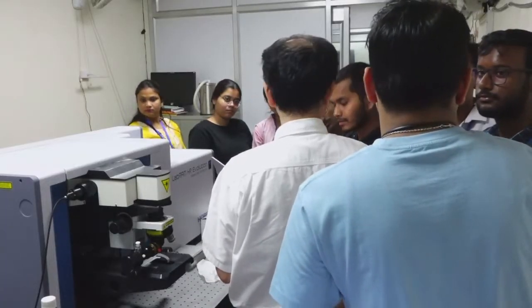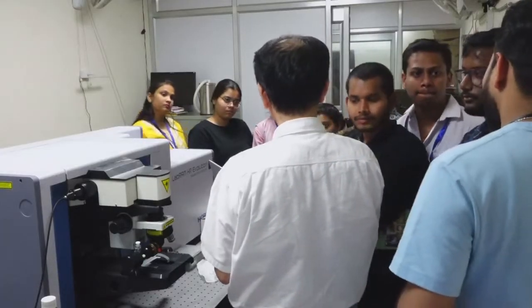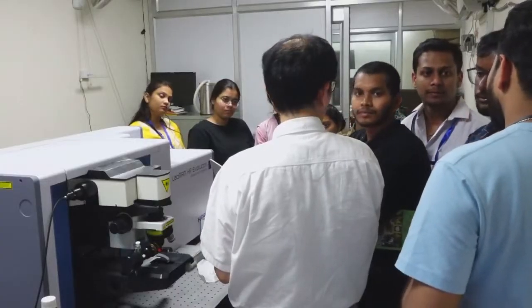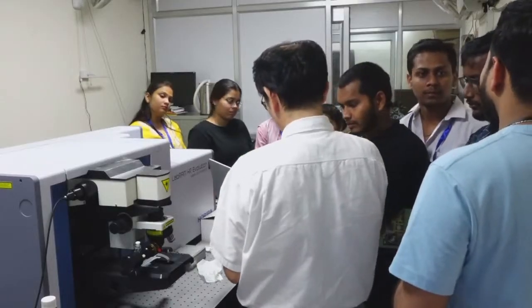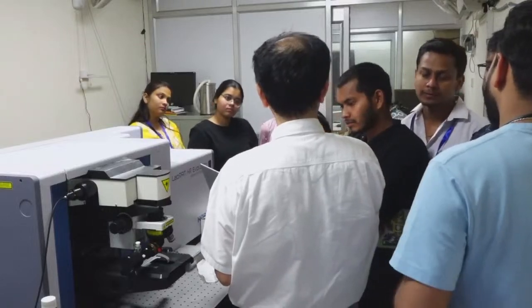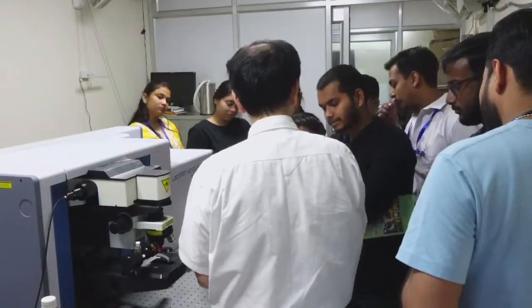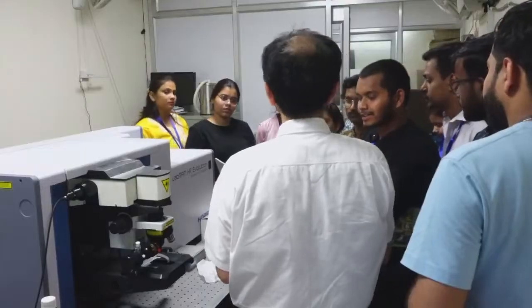It's standardized. A standard sample is generally used to calibrate the instrument. There's no reference sample. The reference is only the excitation source. The excitation source, that is 532 nanometer, is the excitation source. Then with reference to the excitation source, there is a shift of Raman Stokes. Yes, sir. Any other question?